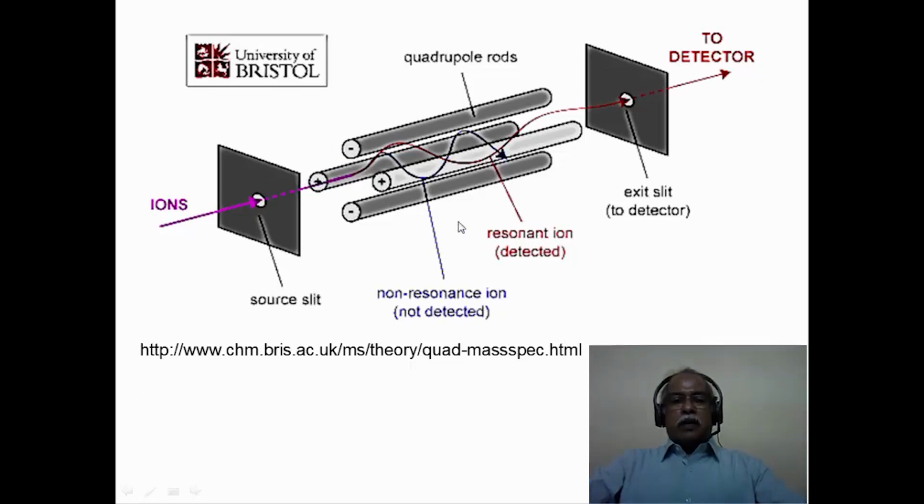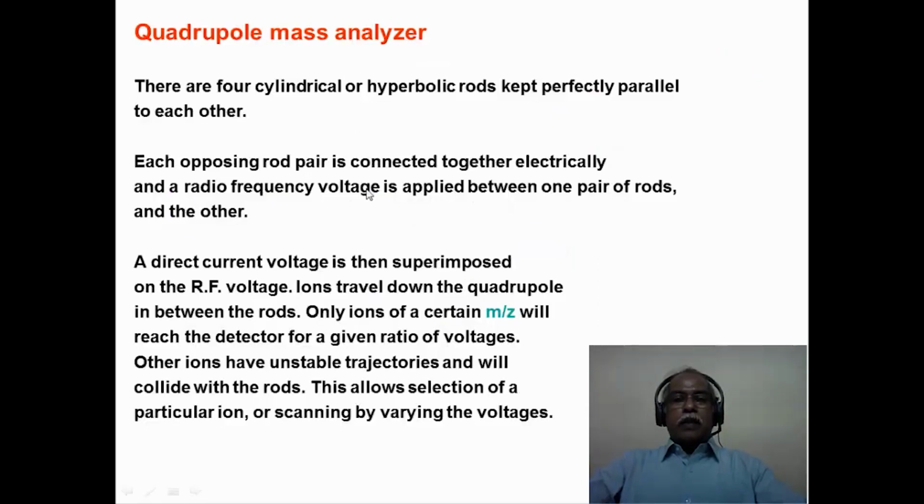So essentially the ion that is produced in the ionization chamber is passed into this particular field, and both a DC voltage as well as a radio frequency voltage are applied. In other words, the radio frequency voltage will alternately change the charge, plus to minus, minus to plus, a rapid change, and the ion has to resonate at a particular frequency in order to escape this intact. For example, only the resonant ions will pass through the analyzer to the detector. The non-resonant ions will essentially hit the walls of the quadrupolar analyzer and get destroyed in the process. So this is the mechanism by which the quadrupole analyzer works.